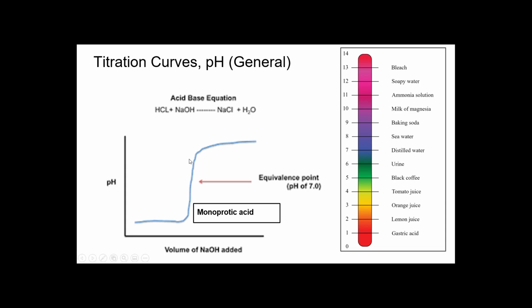And unlike other labs, this is colored. So it instantly shows, based on how deep the color is, how far off you are. That's why they can really see that they were not as patient as they should have been. So it's clear, the pH indicator, and when it hits a certain pH, let's say around pH 8, it's going to change color instantly.